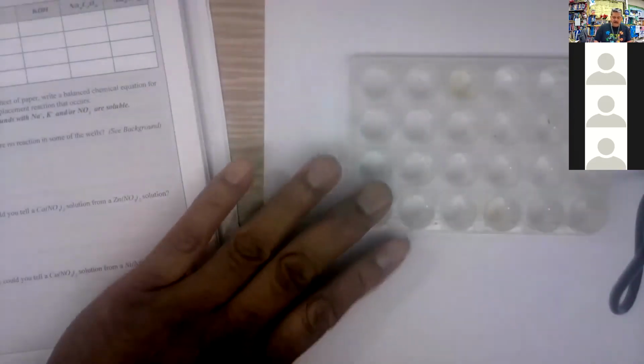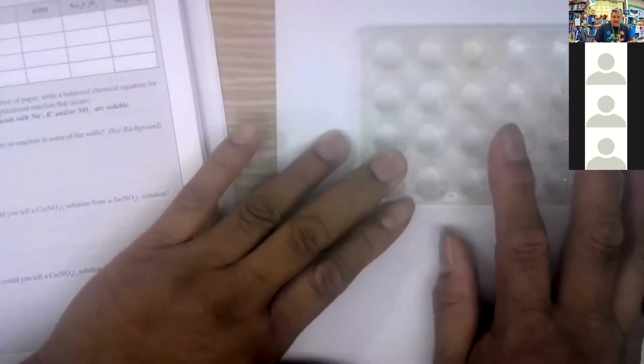And so I'm going to put the chemicals on a white background like that. And then we're going to put the bottles over there in the same order as they are on your table right there.